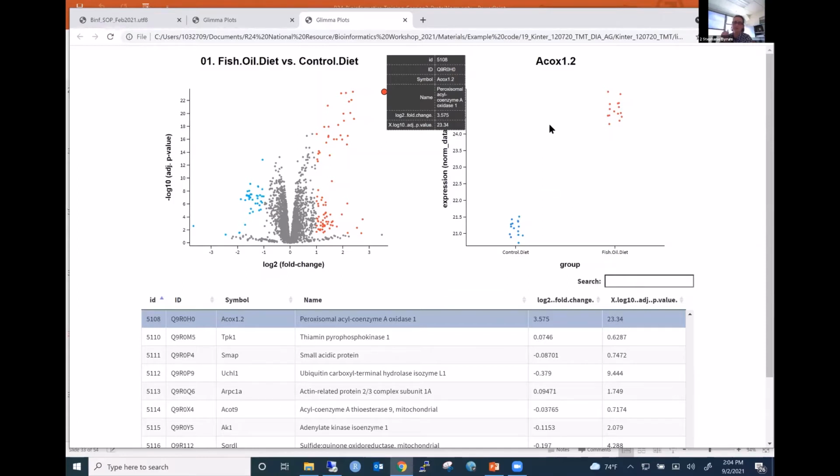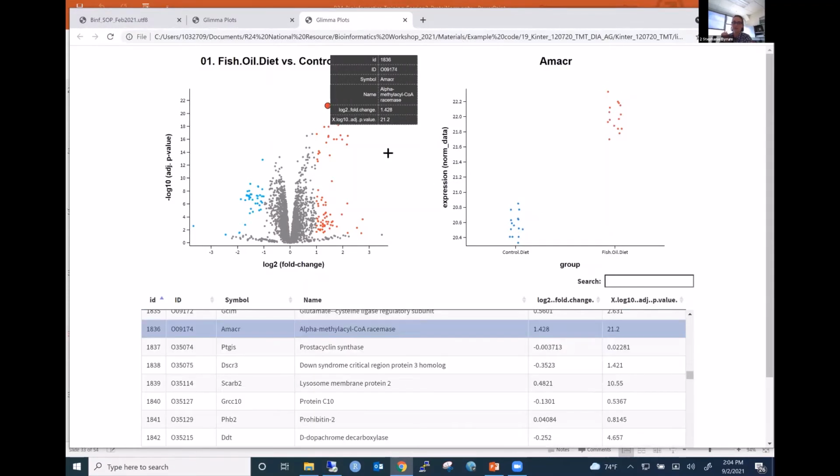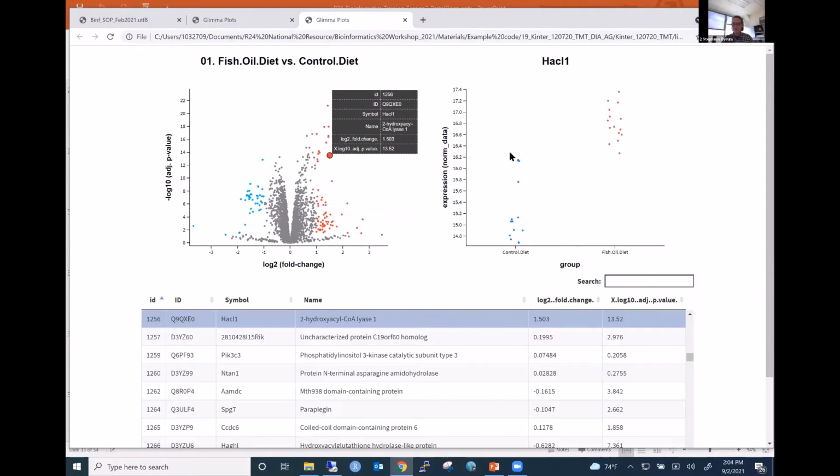Like this one is a very strong difference and all the samples are really tightly similar. So if I'm going to try to find my top list that I want to go after, diving into that deeper approach of what my different replicates are doing has been super helpful.